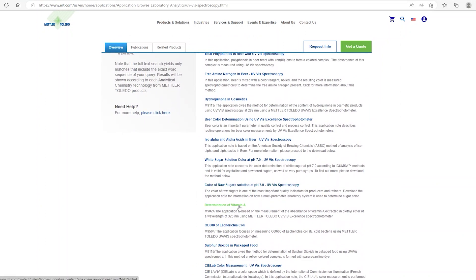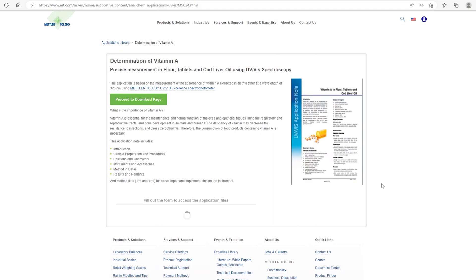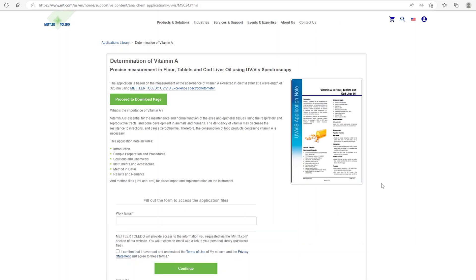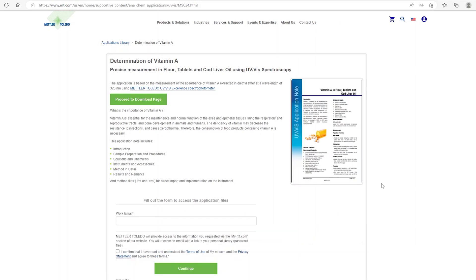Let's select, for example, the determination of vitamin A. Here you can already see a brief description of the application and the preview of the application note.